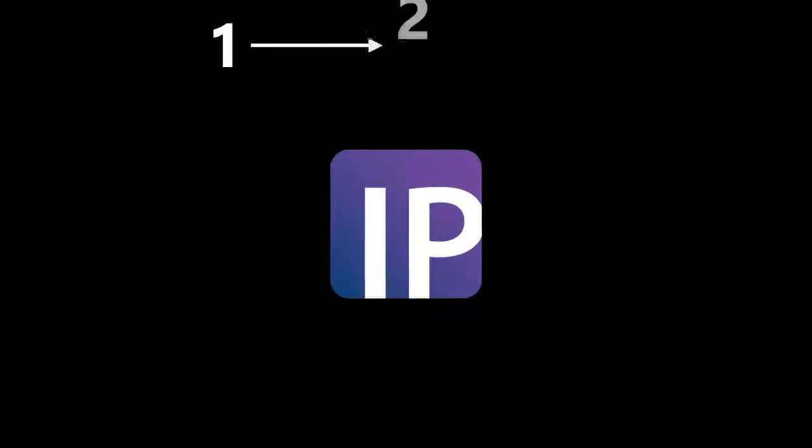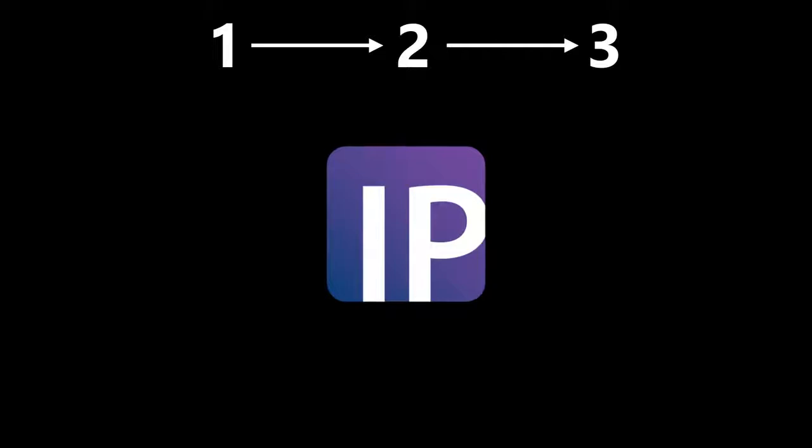Automated measurements are at the heart of ImagePro. Designed as a simple and reproducible process, anyone can achieve results easily and consistently by following our simple three-stage workflow.